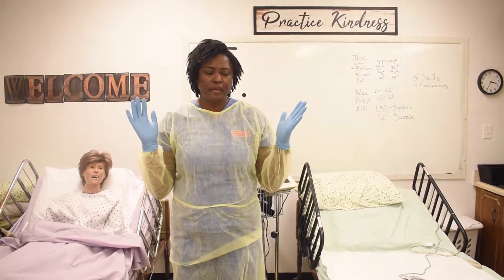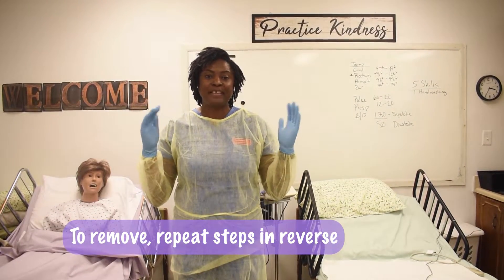This is donning our PPE. To remove, we go the exact opposite way.